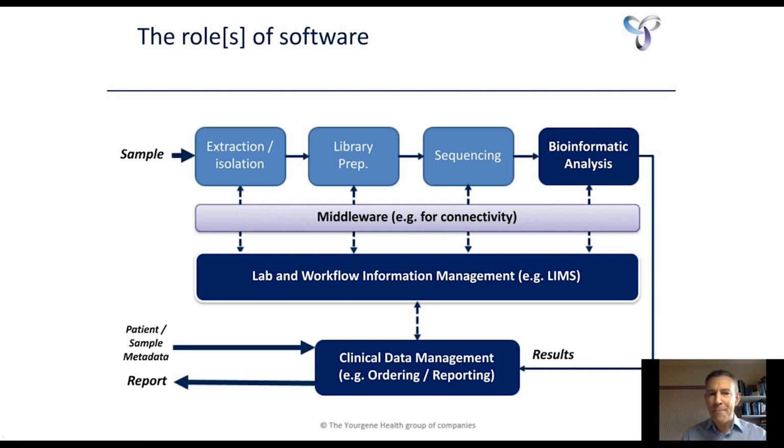And there can be a middleware layer as well, which I've kept not quite in the same blue color. It's optional, really, in many ways. The middleware system is normally a connectivity layer, but very often the workflow management or lab information management system actually handles all of that. In very complex environments, there will be more middleware, but as you can see, there are quite a few places that software is going to appear in any lab test environment.